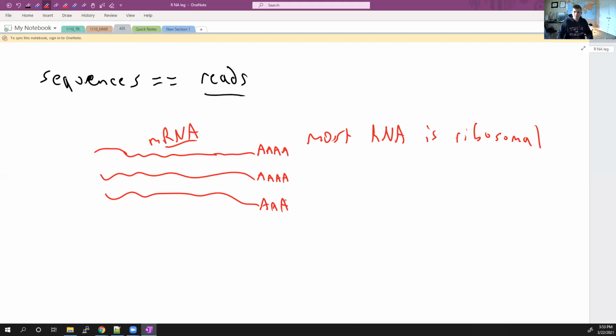But anyways, we can isolate these mRNAs, or better people than I can, by taking advantage of these poly A tails. Basically you grab the mRNAs that have a poly A tail and wash away everything else. And so what we do is we just sequence the mRNA. But again, mRNA isn't very stable. Quite honestly, I don't know how biology works because of this molecule. It's so pathetic, it falls apart so fast. It's amazing that we even work.